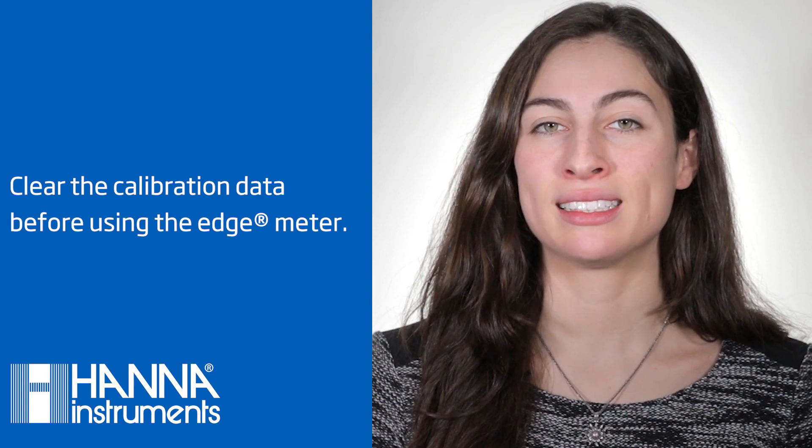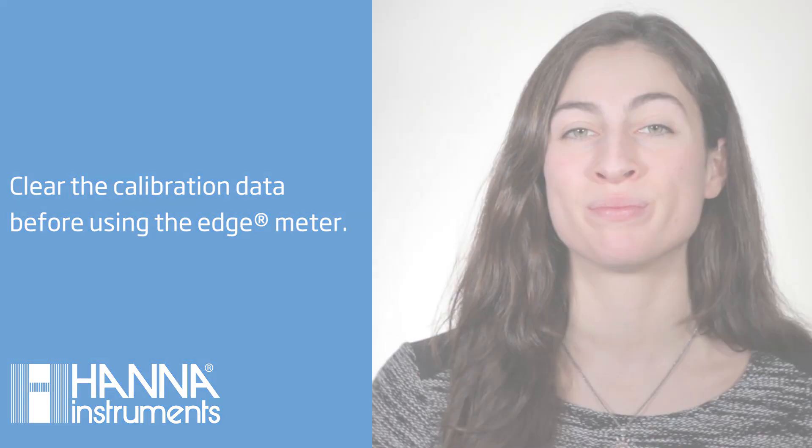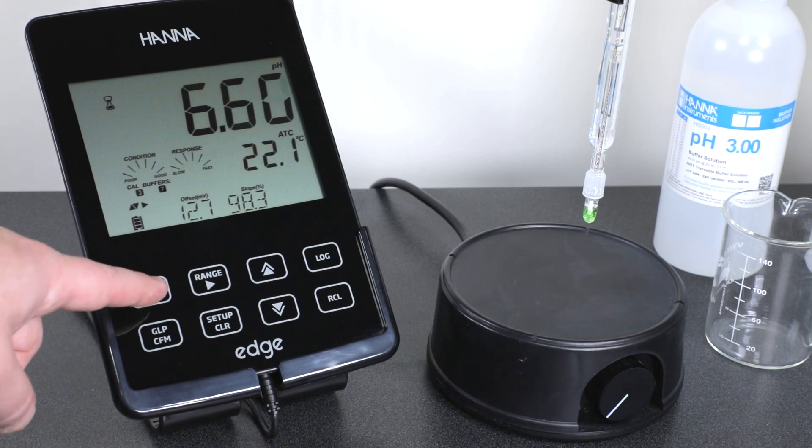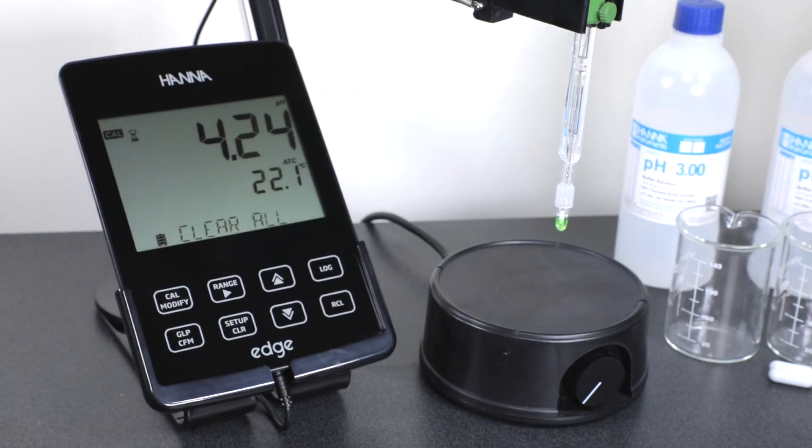Next, we'll want to calibrate the meter. With the Edge meter, the calibration information is stored in your digital electrodes, which enables you to use the same electrode in multiple meters without having to recalibrate. Because of this, it's a good idea to clear the calibration data before you begin. To do this, press the Cal button, then press the Setup Clear button, and then the GLP Confirm button.